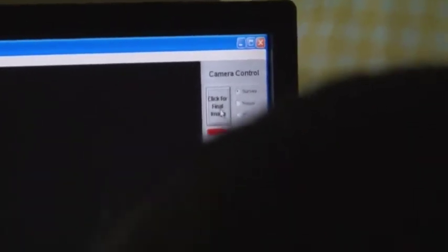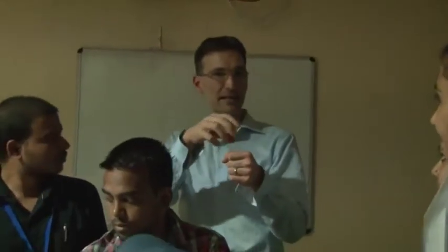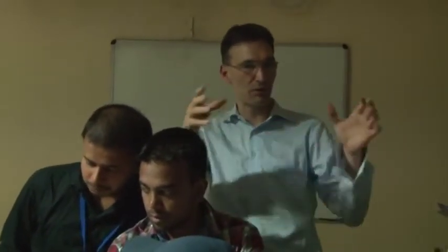Alright, good. So I now want to show a bright field image, and then we are more or less done. Those particles that diffract into those angles get darker, and the other ones which don't diffract appear bright as they did before. The ones that strongly diffract get even darker, and that enhances contrast. This is how bright field imaging with diffraction contrast works.